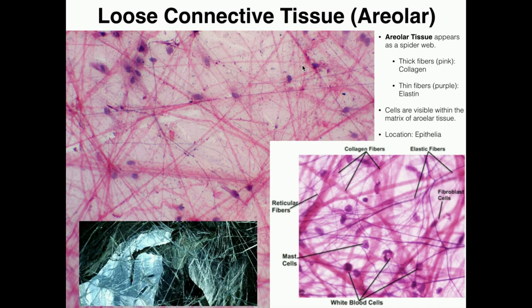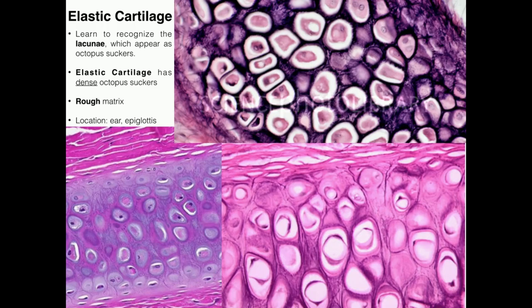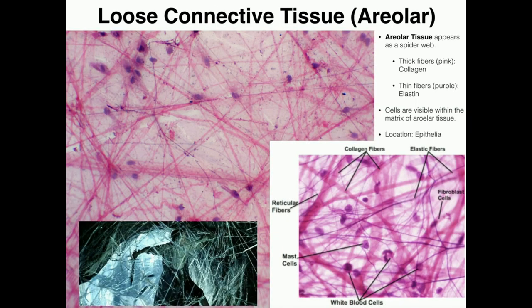Areolar tissue is one of these tissues where you have some things you need to know. First of all, these very thick pink fibers — like right where my mouse is — those are called collagen fibers. Your textbook calls them collagenous fibers; you can use either term. I always call them collagen. That's how I learned it.